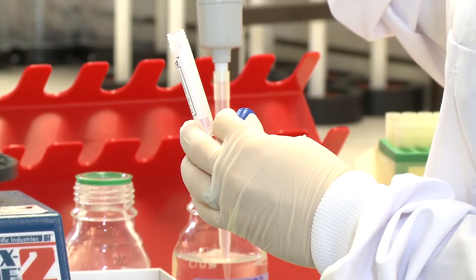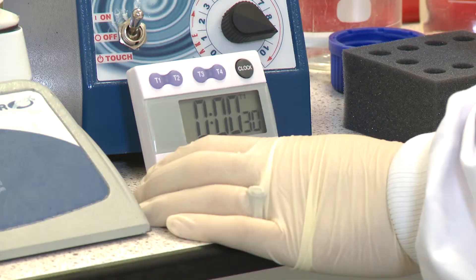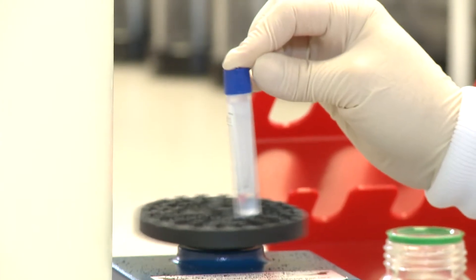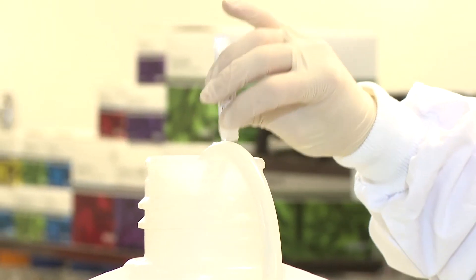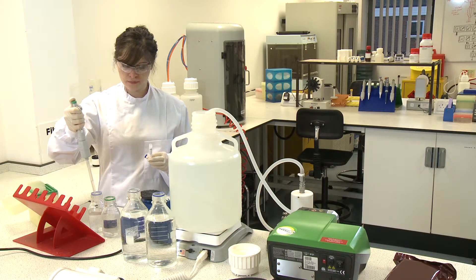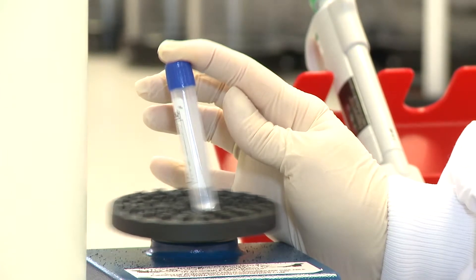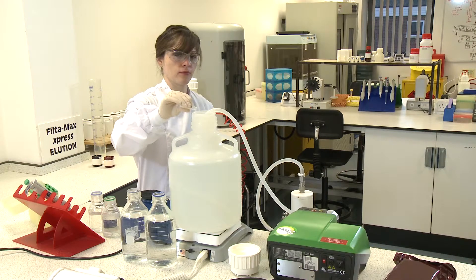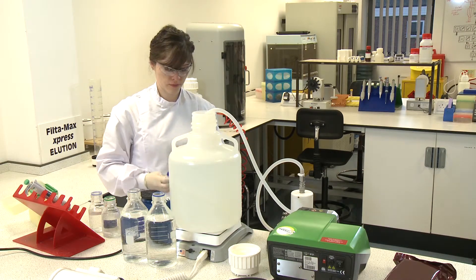Add 3 millilitres of reagent water to the vial and vortex at full speed for 30 seconds. Decant the rinse into the carboy. Add a further 3 millilitres rinse, vortex for 30 seconds and decant. This method of extraction is intensive but provides a consistent transfer of the target organisms.